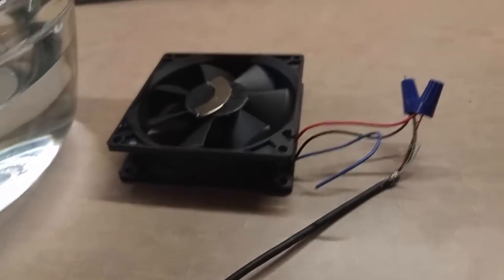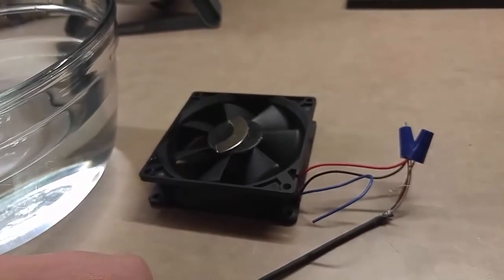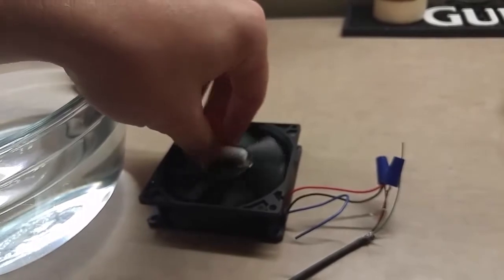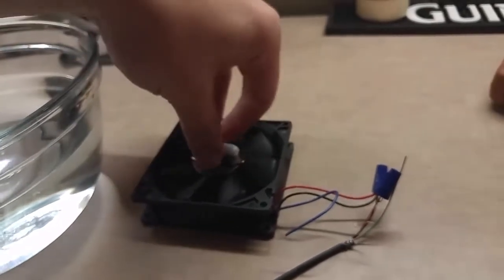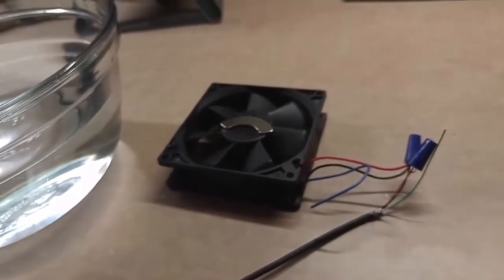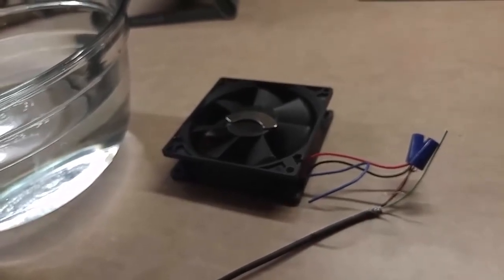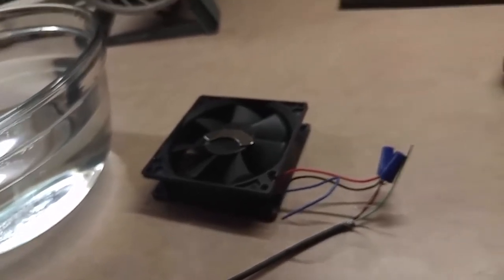I did some experimentation with the voltage. Originally I started with 12 volts — this is a 12-volt fan — but the fan spins way too fast. The stir bar just sits on there magnetically, but the fan was spinning so fast it was throwing the bar off. So I backed down and grabbed a cell phone charger at 5 volts, since USB is 5 volts. It's not quite as much power as I'd like — ideally somewhere around 7 to 8 volts — but 5 volts works. 12 volts was just way too much.